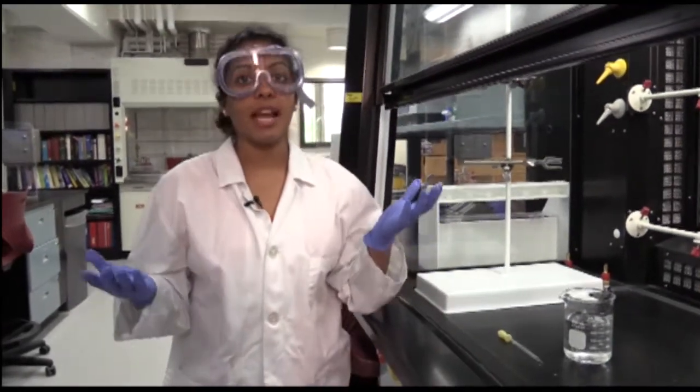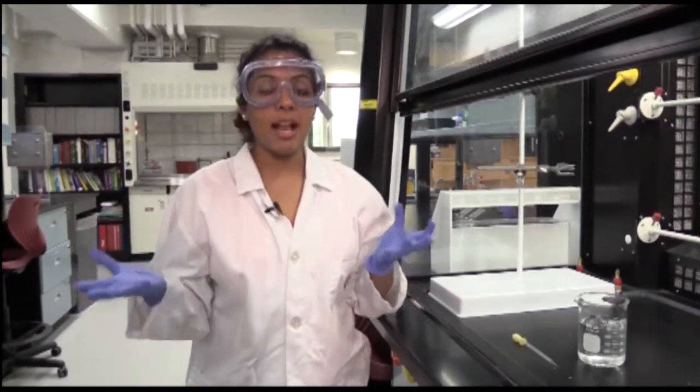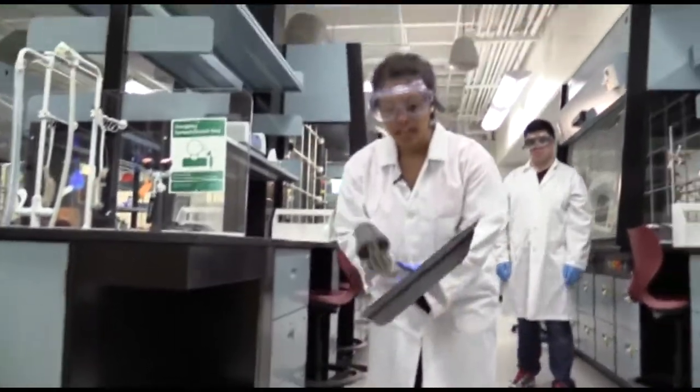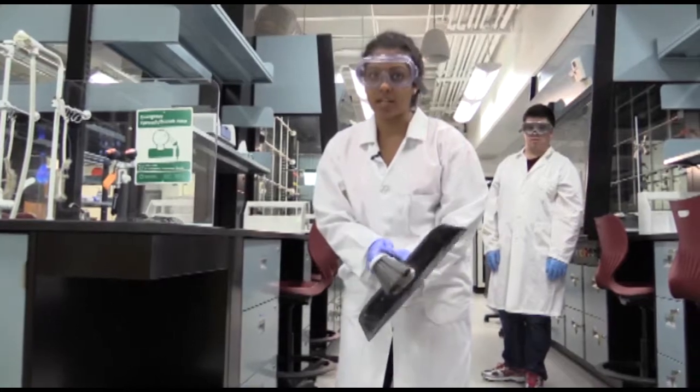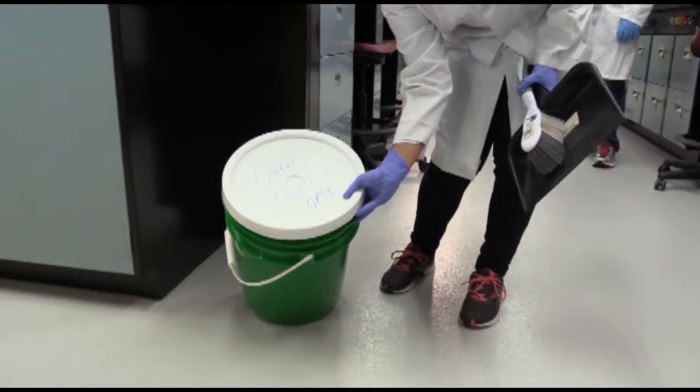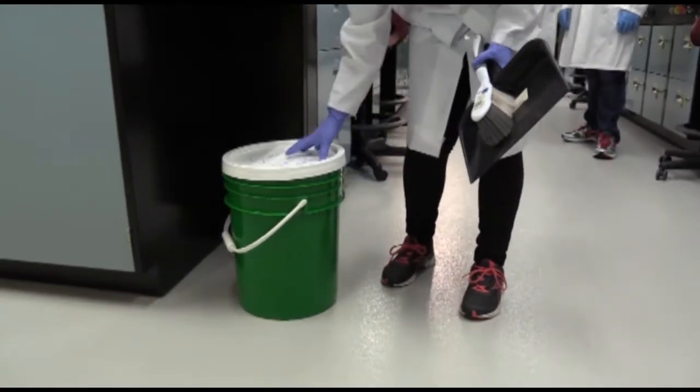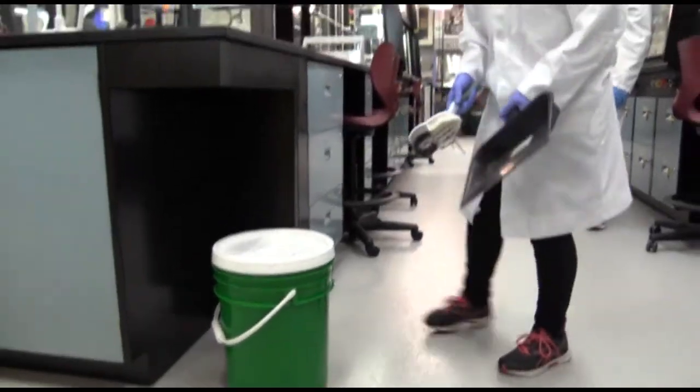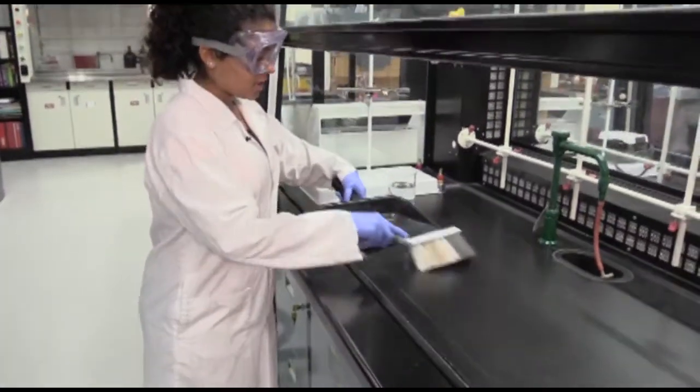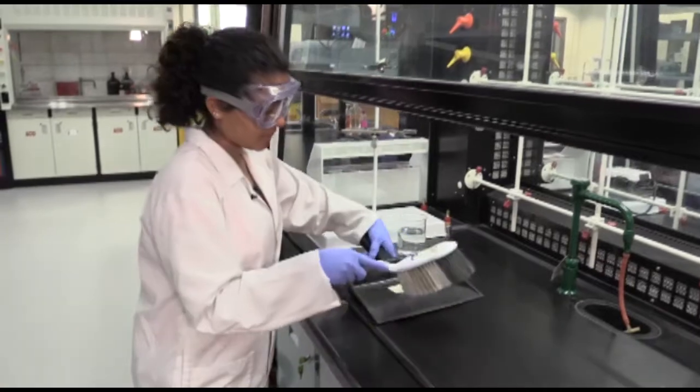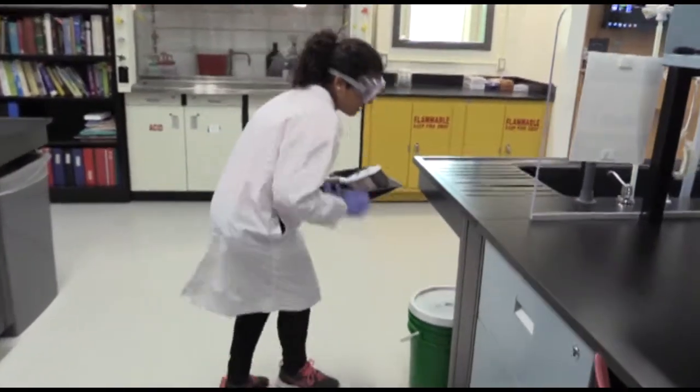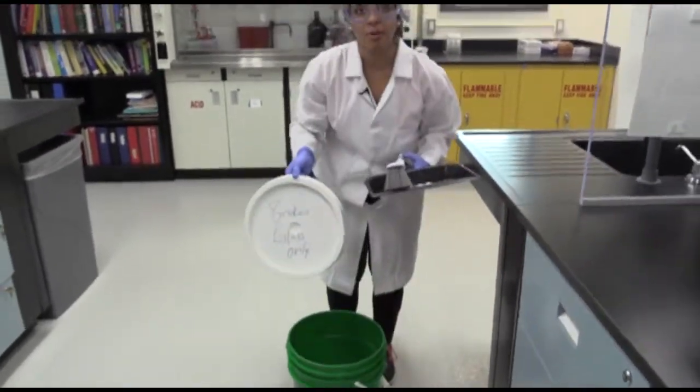If you do break something, like I said, approach your TA or instructor and they will help you clean it up. Over here, we have a dustpan and a little broom and you're going to use this to clean up broken glass. This green bucket here says broken glass only. When you break something, you've got to put the broken glass into this bucket. So, when there's broken glass, you've got to clean it up and then it goes into the broken glass bin. Like I said, broken glass.